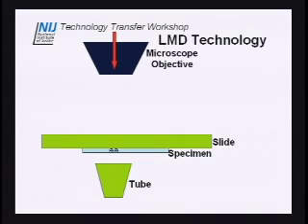So on the top, you'll see your microscope objective right here. And the laser beam in red that you see, that's where the actual laser beam comes through the microscope objective. And down here is the slide. What you do is you have this slide, and I have, I guess, a layer. This is an old version. There's actually a layer here, if you can see it there. That would be the pen film that's already prepared on the slide. And then you prepare your specimen smear on that pen film.